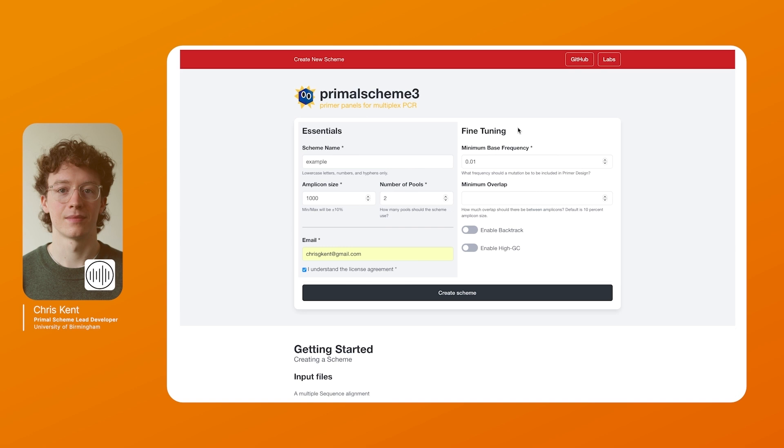Furthermore we have options to enable backtracking. This is when you create the tiling scheme. If you hit a region where you cannot create a new tiling overlap it will take one step back up the tree and then continue and try and find another solution. It generally is very expensive to do and it will increase your run times by quite a bit. So generally it's not worth doing unless you're having issues with gaps in your scheme. Same for high GC mode. If you know the genome you want to sequence is very high GC it's worth enabling but otherwise it is not.